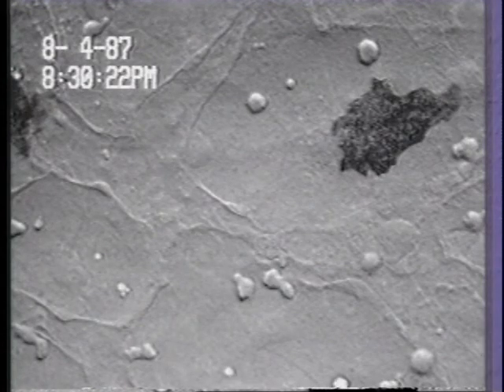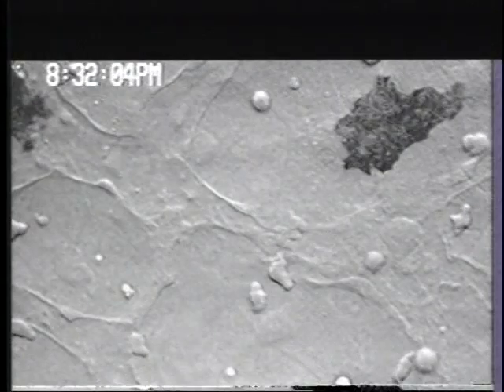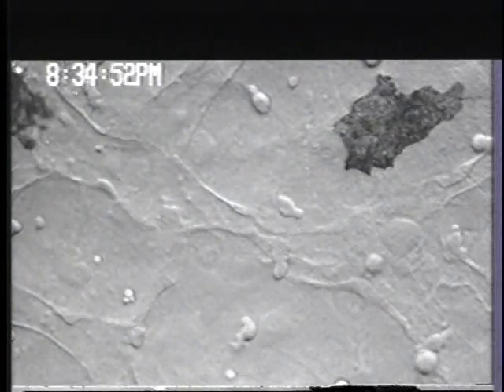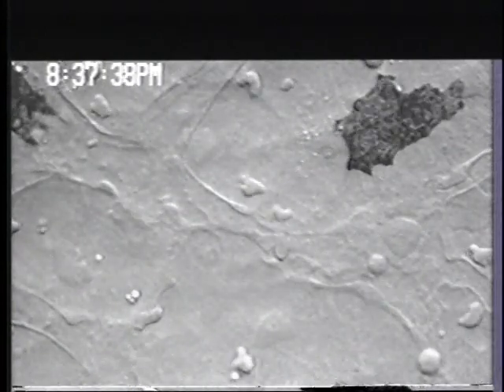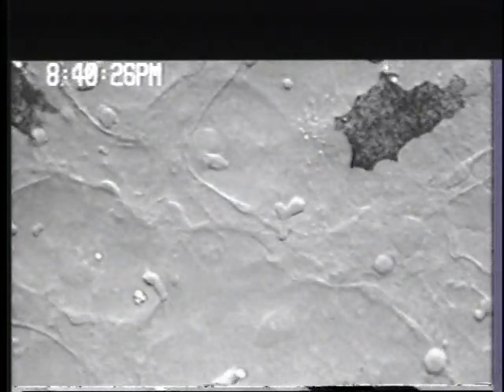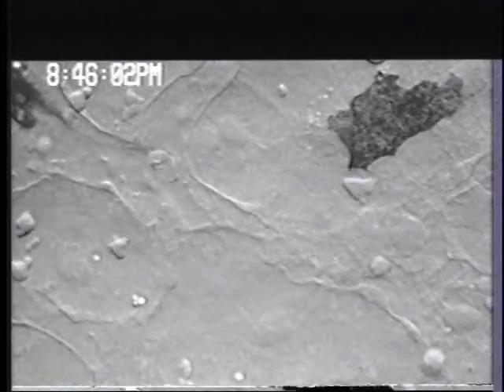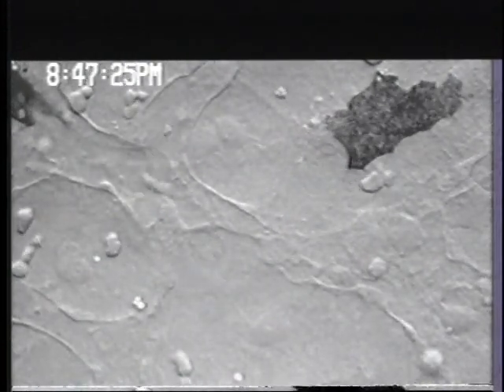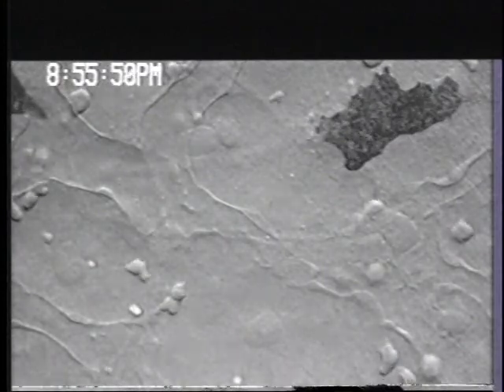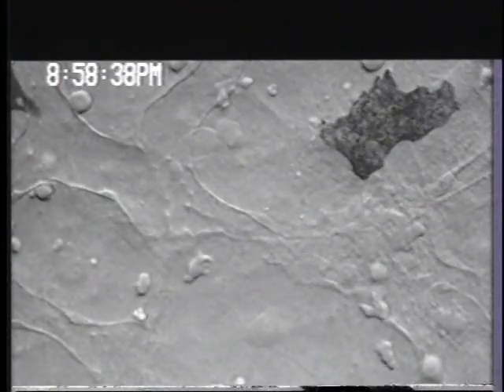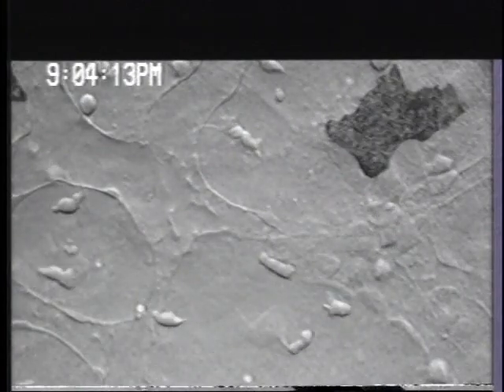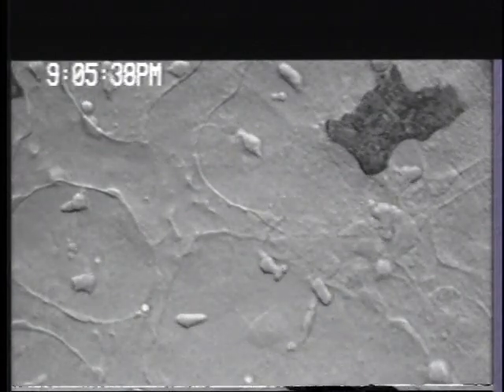This is a time-lapsed sequence of a region of the yolk sac of an embryonic killifish that is about two days old. The field of view is approximately 250 micrometers in diameter. In this region of the embryo, you can see a large black pigment cell, many migratory deep cells, and the beginnings of blood vessels formed by endothelial cells. These blood vessels must form in a carefully coordinated manner throughout the entire embryo to ensure a closed circulatory system.